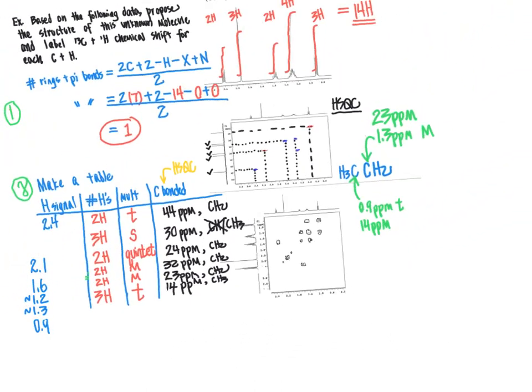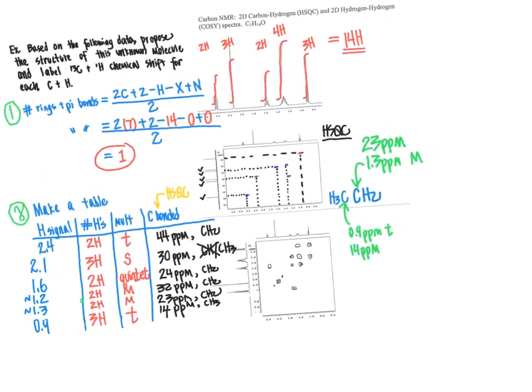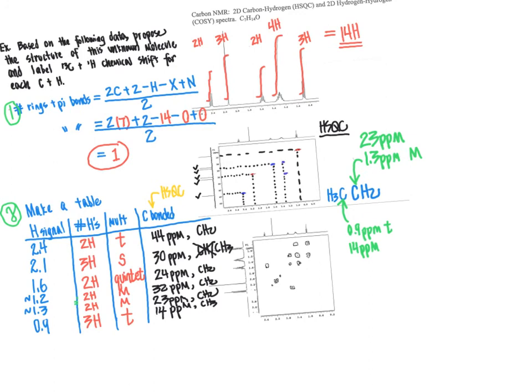What if we plugged into our chart here, get this line back up, our CH2 right here, hypothetically, what if it was bonded to another CH2 group right here, and we said, tentatively at least, we'll label that CH2 group as the CH2 group that is at 1.2 ppm, which was a multiplet and a CH2, and the carbon there was at 32 ppm.